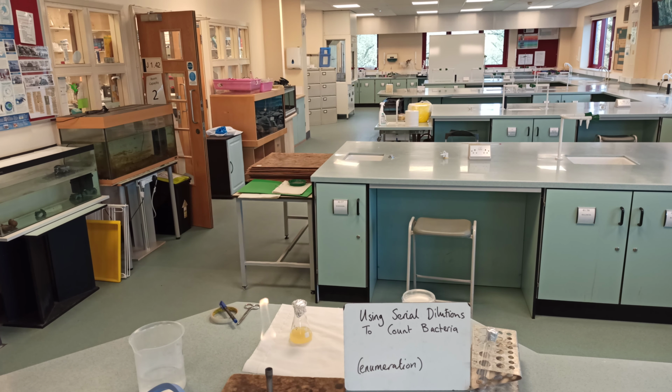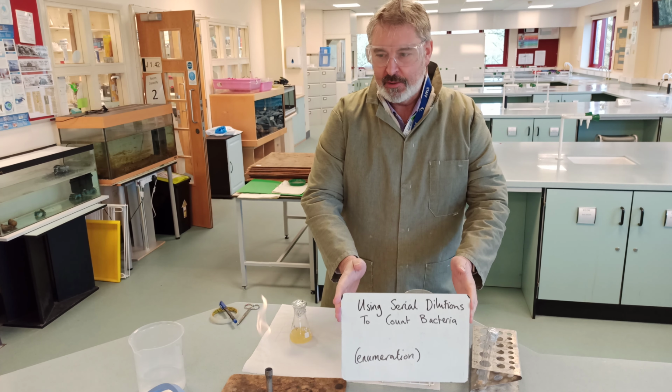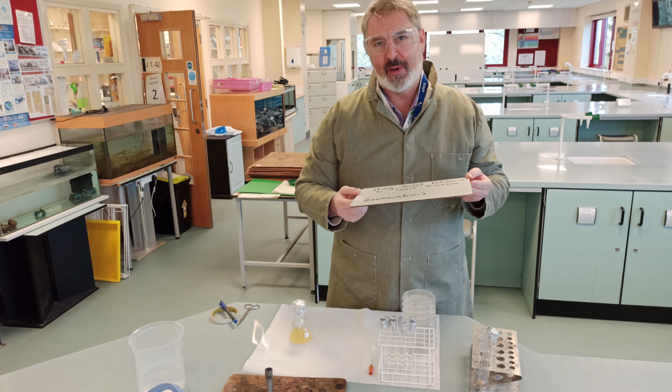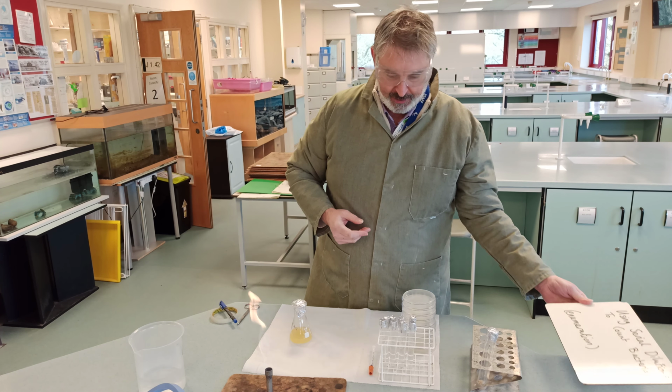In this video, I'm going to demonstrate how we can use serial dilution to enable us to count, or estimate, the amount of bacteria that we have available.